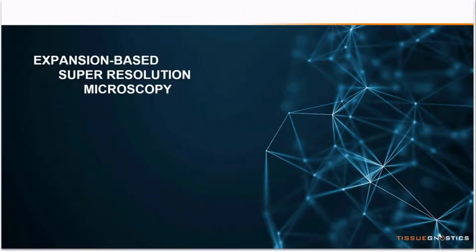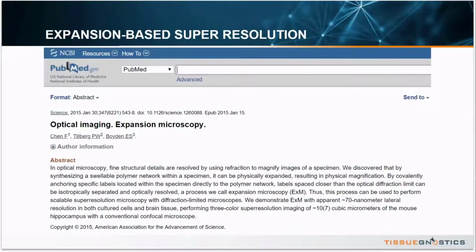Now we can combine this technology with another technology that we were introduced to yesterday in the opening session by Ed Boyden, expansion microscopy. So I can keep this short. Rather than introducing ever more technically demanding and more expensive solutions, Ed and his team had the ingenious idea to reproduce the expansion of the universe on the nanoscale.